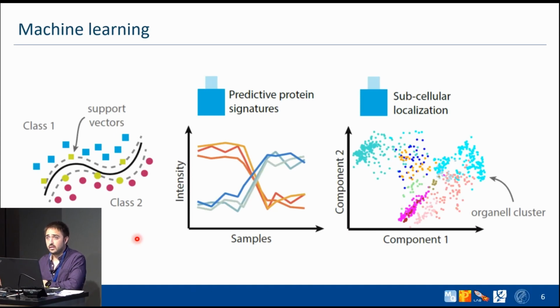So let's say predicting the state of a system given the proteomics expression. Another use case is different. It's more related to the differential expression test. What you can see here in the middle is an alternative way of finding a set of differentially expressed proteins or peptides that are part of a protein. The idea is that you do the same as before: you train to predict healthy or sick, and then at the end you analyze your model, your classifier.